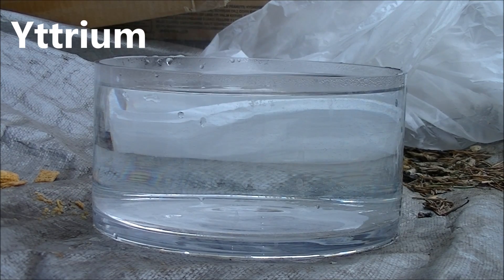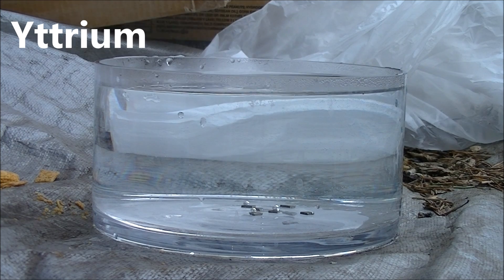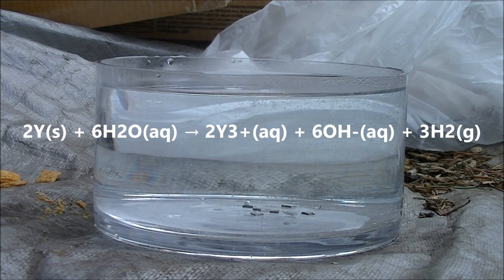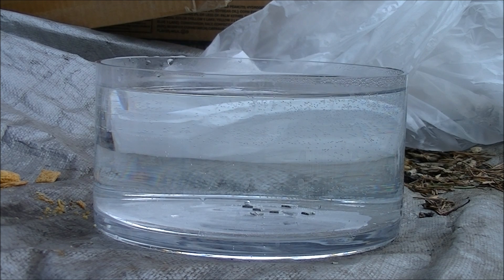Next up is yttrium. One thing I forgot to mention is that group 3 elements only react with hot water. And, like scandium, yttrium barely reacts with it at all, forming tiny amounts of yttrium hydroxide and hydrogen gas.